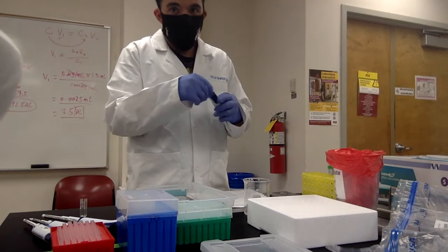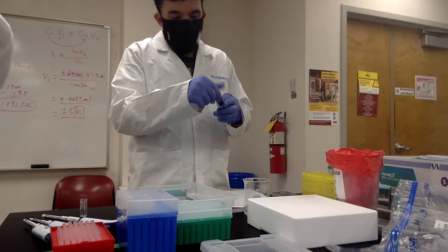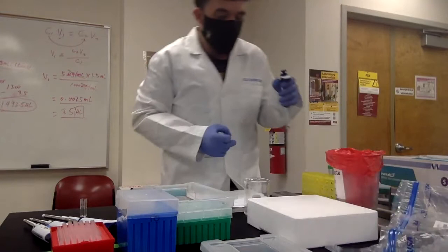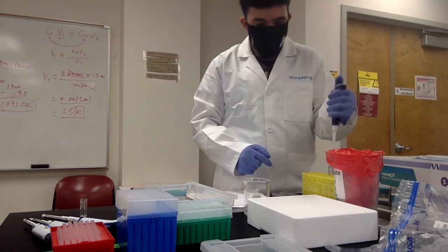One mil is okay, but 1.5 is safer. I usually do 1.5 because that gives you more solution. This is 7.5, correct? Yes, in the lab report, it put 1.5.